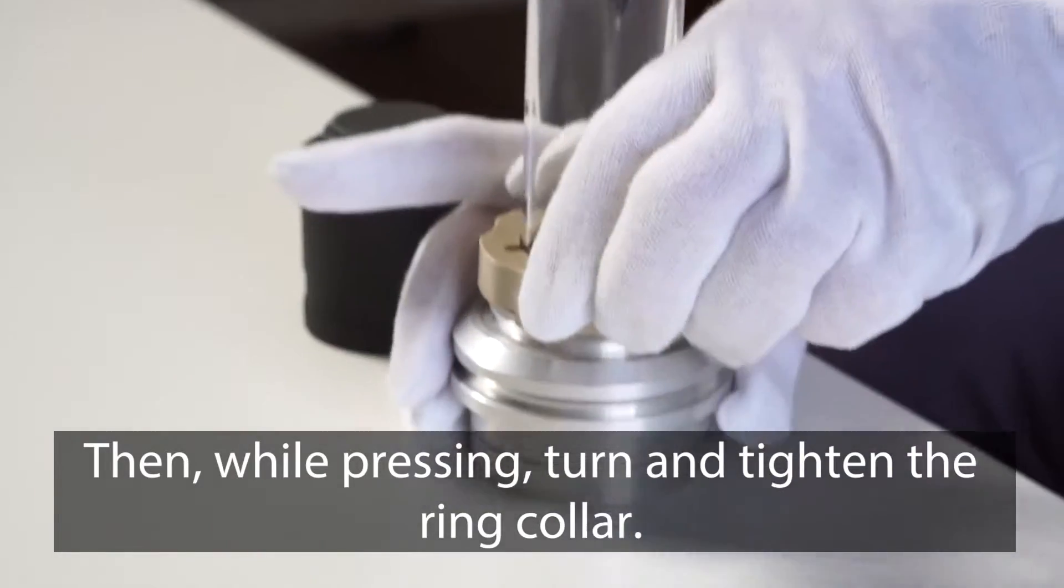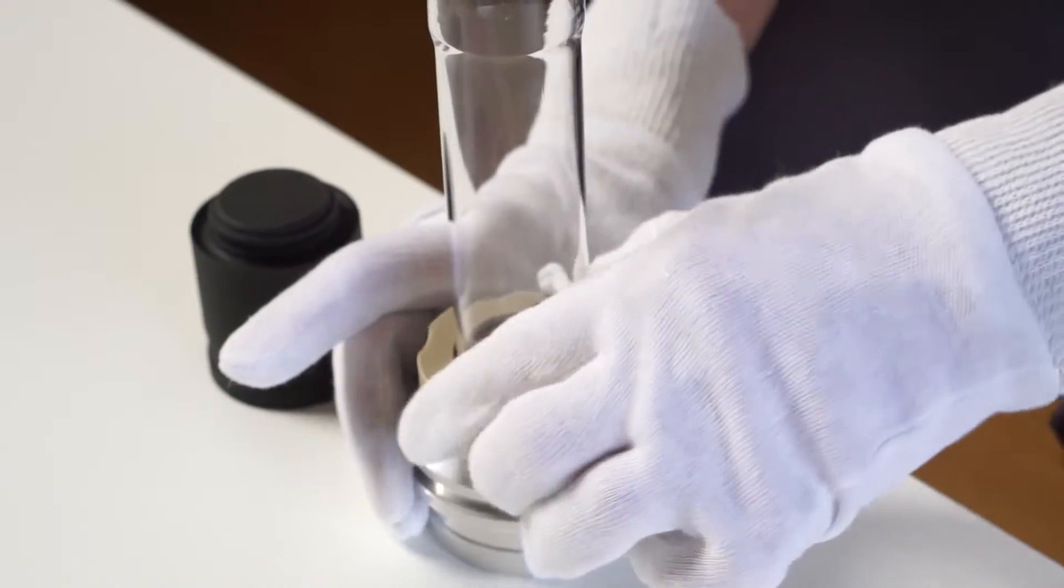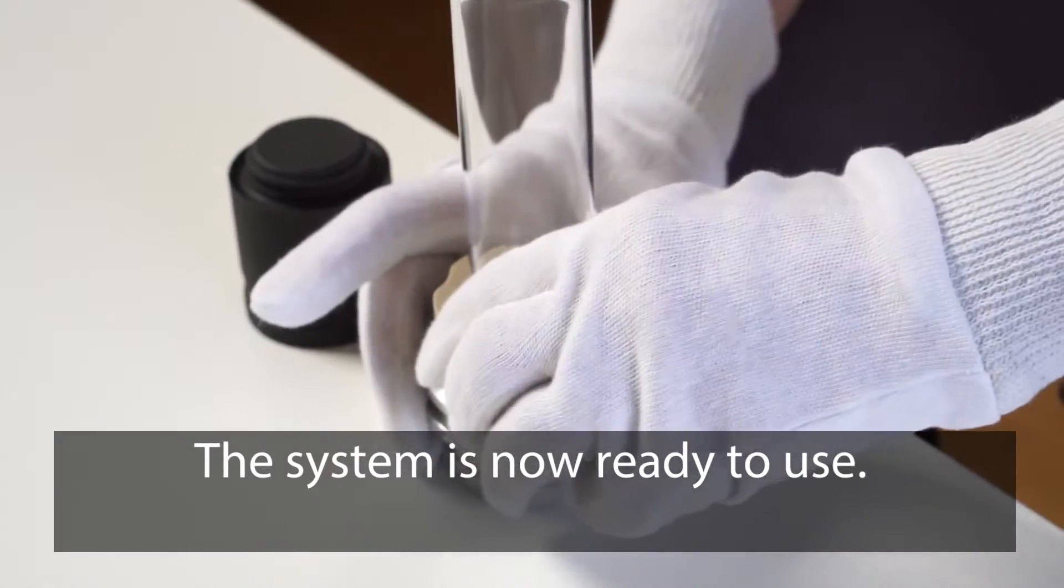Then, while pressing, turn and tighten the ring collar. The system is now ready to use.